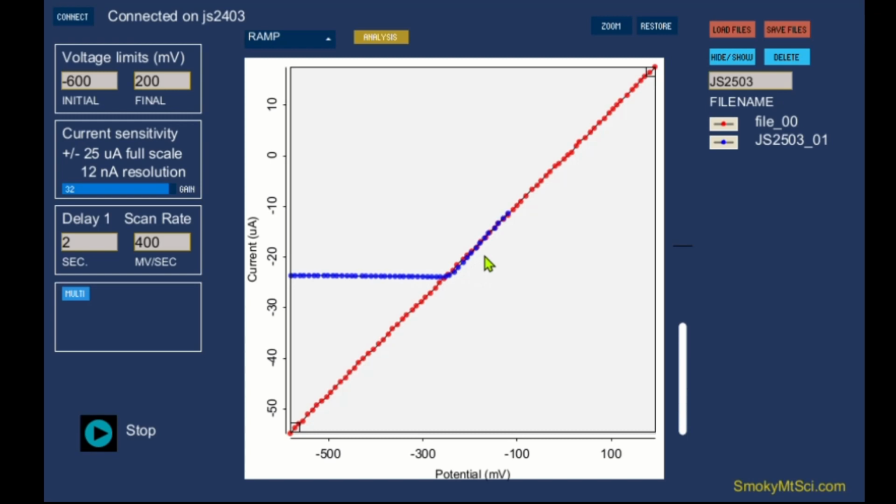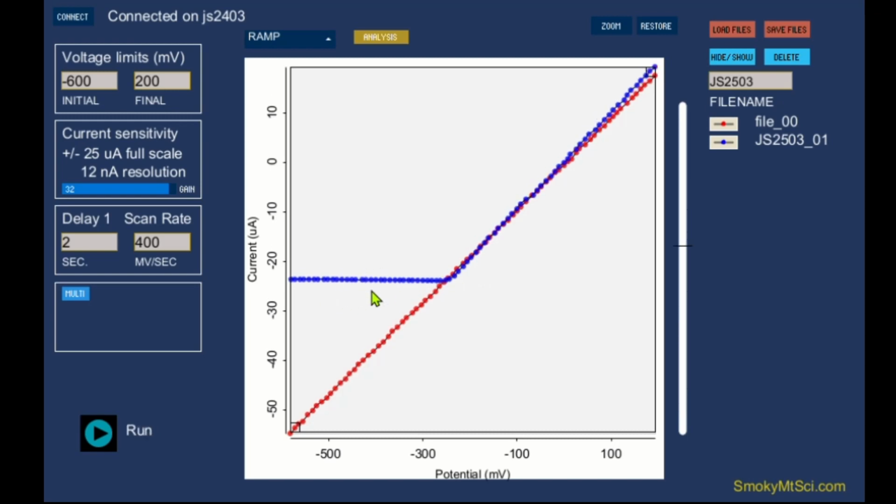And you'll see that the data starts out low, and it's flat at the start. The reason it's flat at the start is that we have maxed out our A to D converter on the negative side, right? This is as far down as the bar will go, and it is down to the limit. Okay, so if we had gone up to the top and we had flattened out there too, this would have gone up to the top, right? So we have our gain set too high in this example.